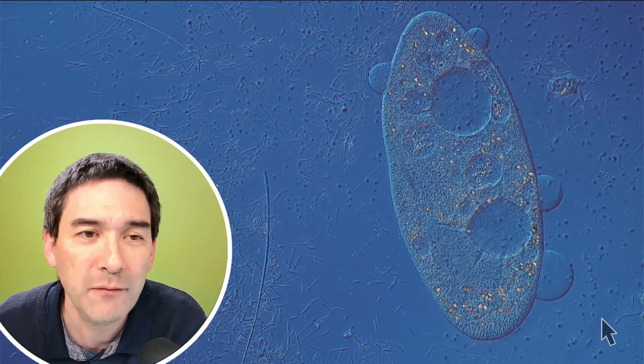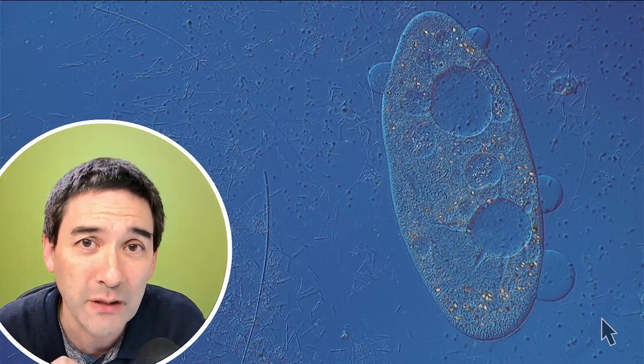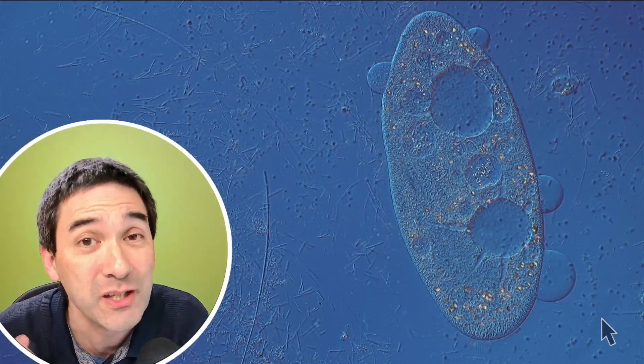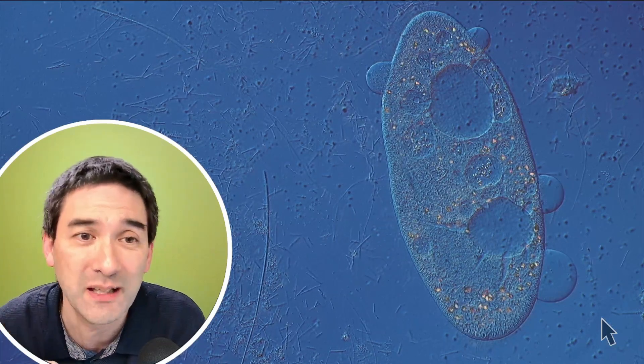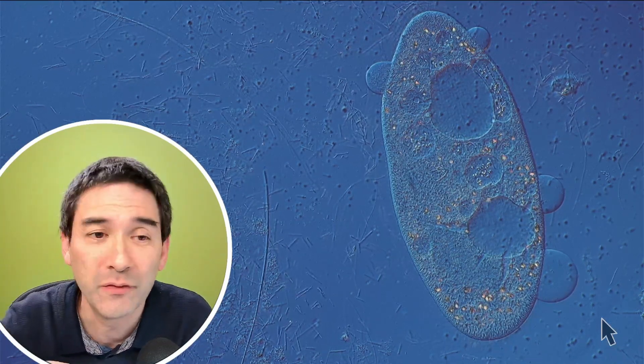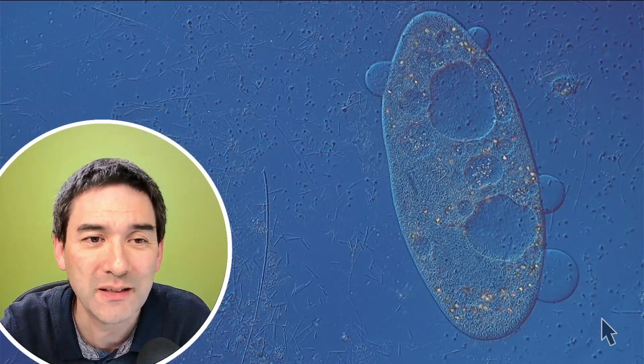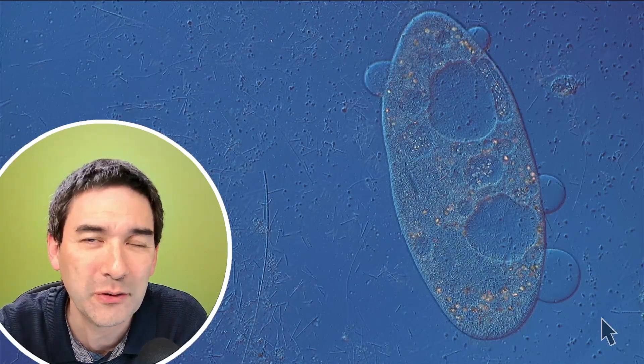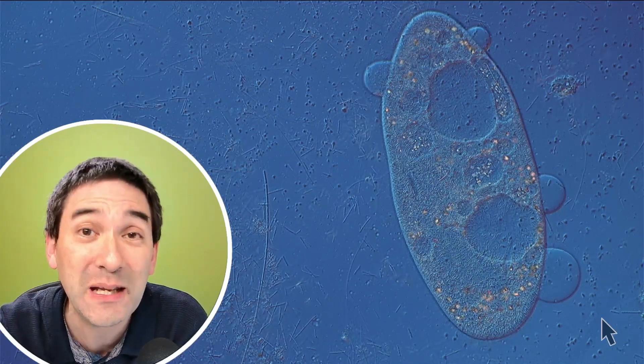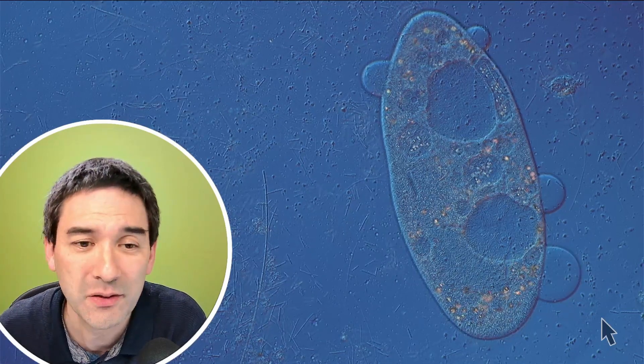Generally, if you compress a cell between the microscope slide and cover glass, this does have the advantage that you're really limiting its movement and making it easier to look into the cell. That's why we're able to see all of those tiny cell organelles in there. But of course, this also means that the cell becomes a little bit deformed and sooner or later this is not going to be sustainable for the cell and the cell will actually die. You can see now that the cytoplasm starts to exit the cell more and more.